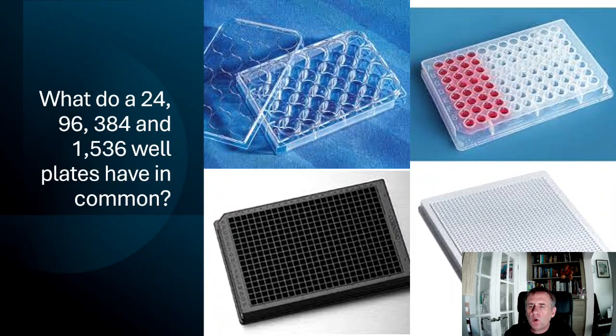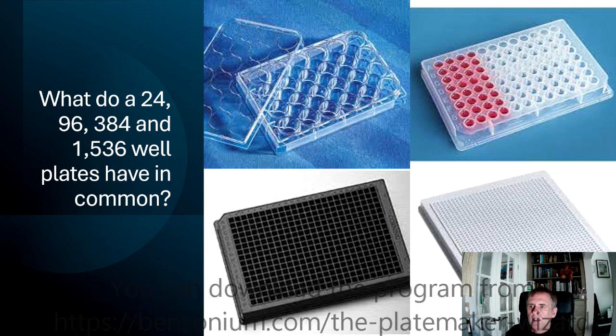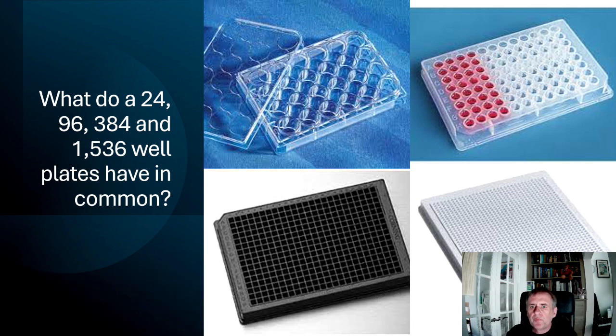Hello. So what is the Platemaker Wizard? Well, if you're a scientist who does microtiter plates, then this program is for you, as it will transform your data analysis.